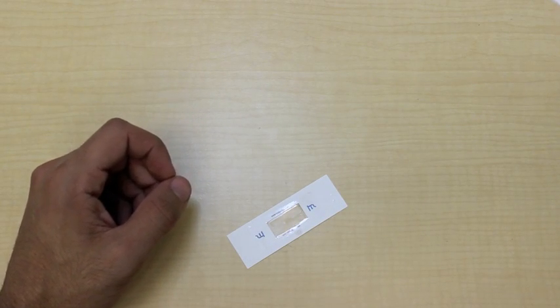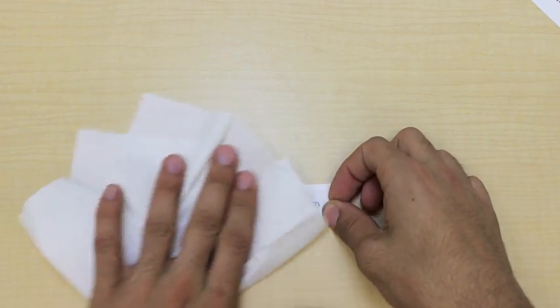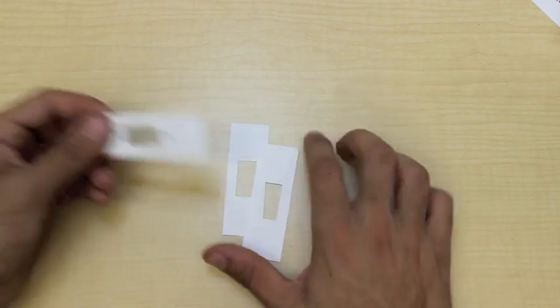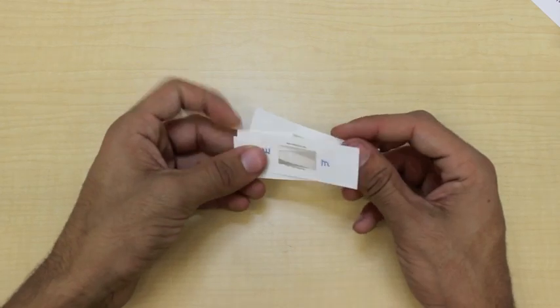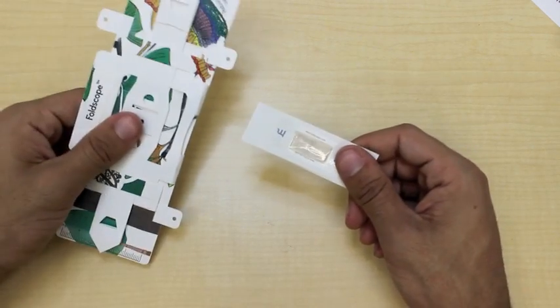Now, we can take a paper towel and clean off any liquid that may have leaked outside. And there we have it, our slide. Same as before, we can insert it by stacking it on top of two blank slides, and then inserting this into our foldscope.